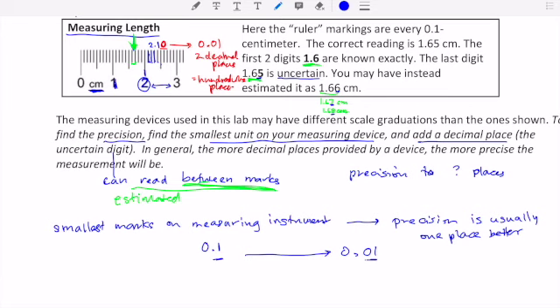So on the beaker, in your glass beaker and your lab equipment, the smallest marks are actually the tens. You'll see 20, 40, 60, 80, and then marks in between there. That's the tens place. And so 1 place better than the tens place is not 10.1 or 10.01, but it's actually this, what's held by that 0. This is the ones place. So the beaker measurements, the beaker that you're going to be using today, those measurements need to be to the ones place.